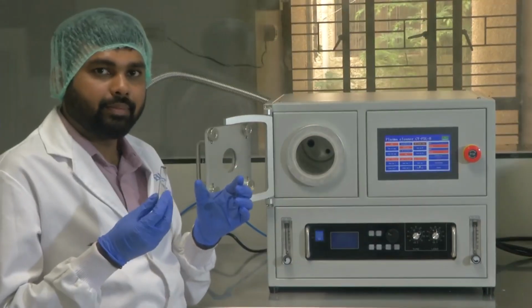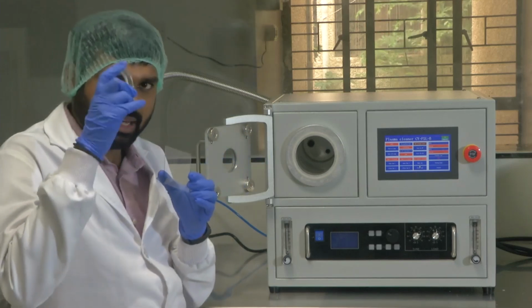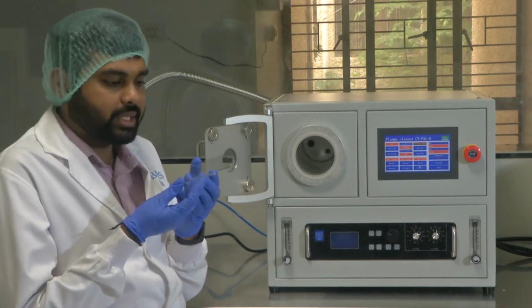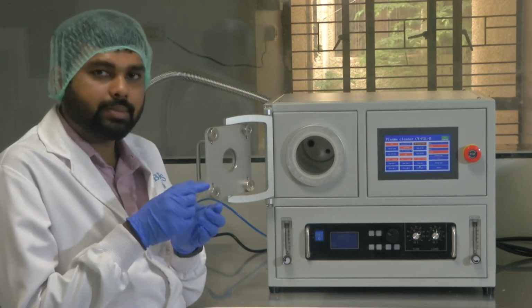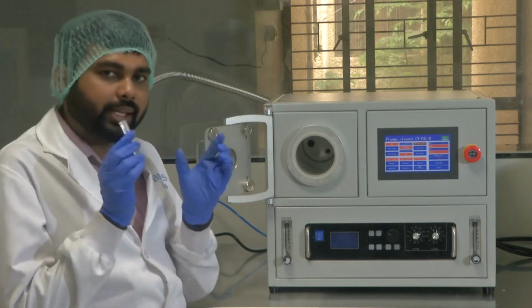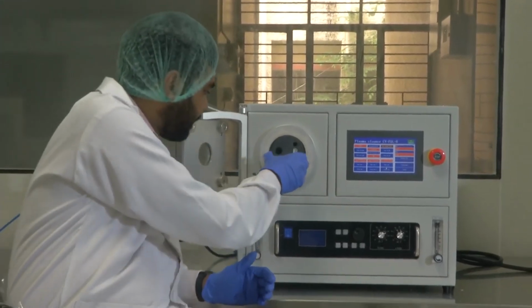As the next step, we will be bonding this glass slide with this PDMS membrane. You can see the membrane, PDMS, flexible material. So what we will do is we will place both of them inside the oxygen plasma. Both the surfaces will get activated, and then we will take it out from the plasma treatment and see if they will bond. Okay, it's going to be really interesting. Let's do this. Let me keep these two inside the chamber. Okay, so we are going to place the glass slide inside the chamber.